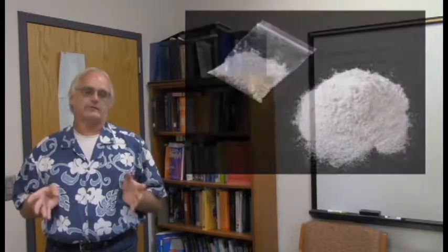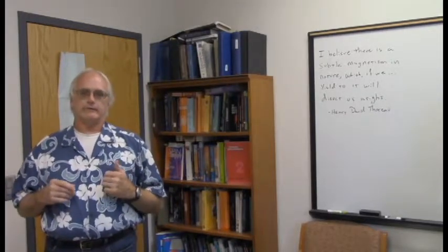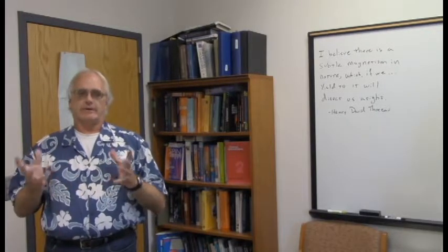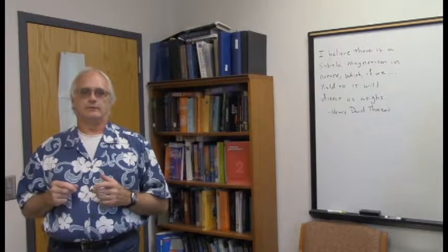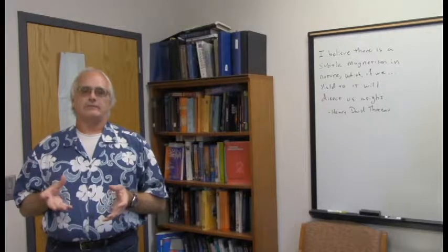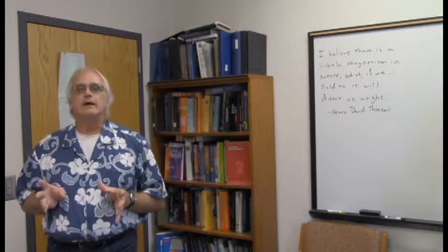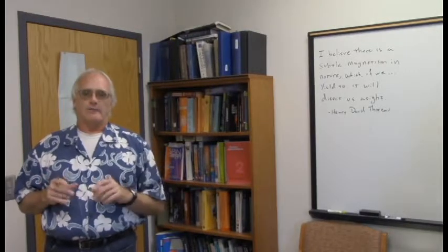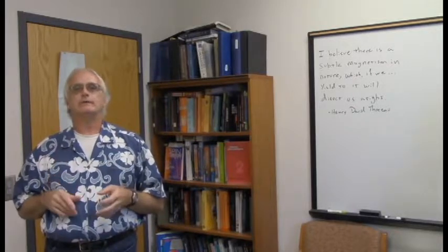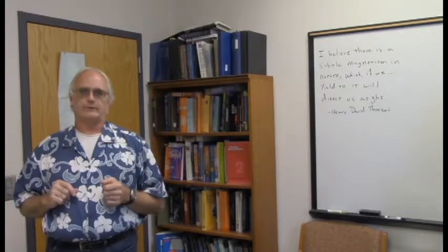It's not like we're a synthesis project and we kind of know what we were trying to make and what we started with. It's not like we're doing a natural product extraction where we have a decent idea of what it is we're trying to separate away. What we have is simply this mysterious white powder, and we're not even going to have the advantage of doing any mass spectrometry or knowing molecular weights. All we know is it's a mysterious white powder and it's going to dissolve in a little bit of chloroform. And so, strictly NMR spectra.